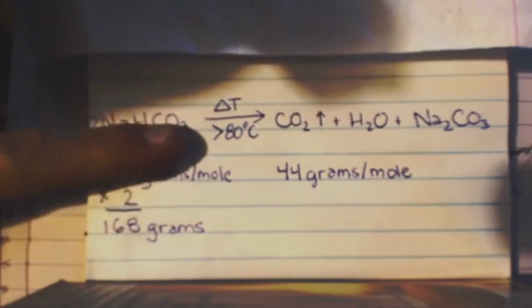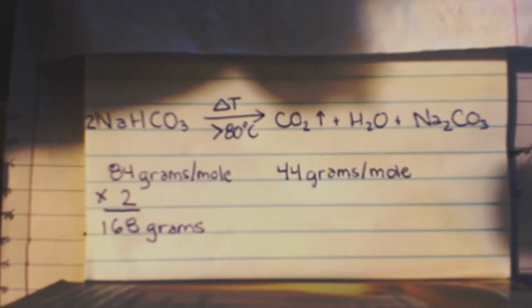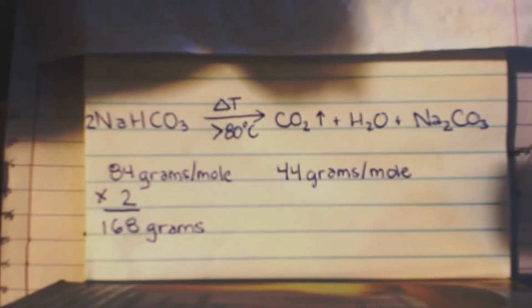Keep in mind, you only have to go greater than 80 degrees C. Although that might be too slow at 80 C. You might have some suck back when you're trying to bubble something through because it's not making enough.